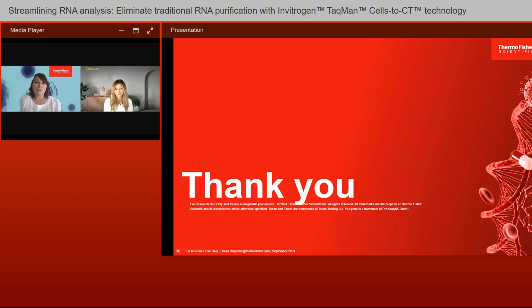This is another good question because it very much depends on the cell that you're using. As I mentioned in the presentation, we tested with a lot of different cells from a wide variety of sources. And so because we haven't tested with everything, you would probably need to know for your specific cell what is the maximum amount that would go in. In the user guides, we have what we call a pilot experiment, and that's what we did to validate these specific cell lines that they work with the kit.